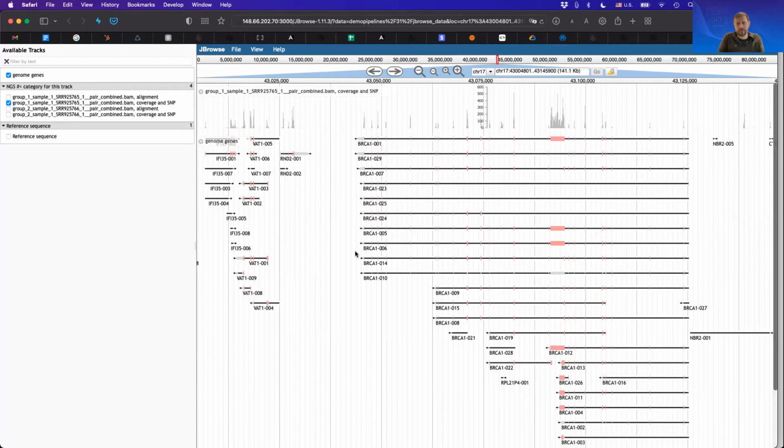Okay, the answer is that it's not full genome, right? Arpita is saying sequence stretches are short, only coding area seems to have the reads. That's right. So if you look where this is, it is only the coding region, right? This matches exactly this red or pink little section, as well as all of these abundances. So the majority of the reads actually just map here.